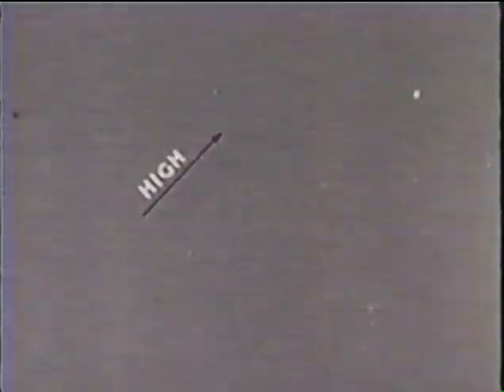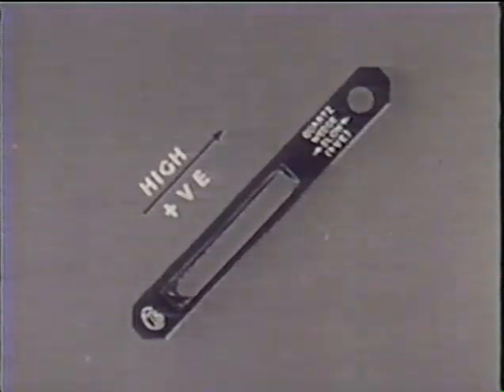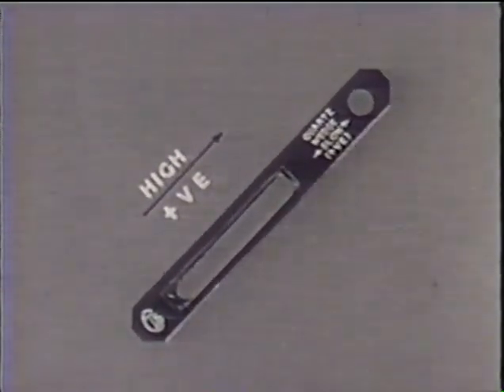In any crystal plate, the vibration direction with the higher index is called the positive or slow direction. Quartz wedges are usually cut parallel to the crystal axis. Their length is therefore the positive direction. The corresponding direction in a crystal which reinforces the quartz wedge is also positive.